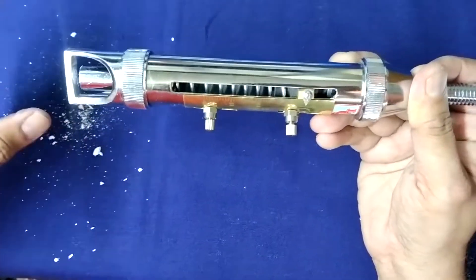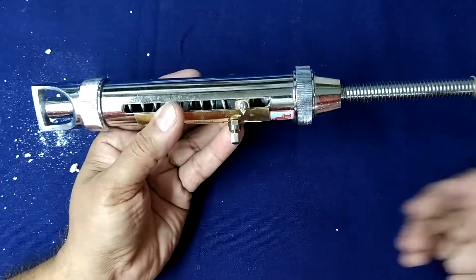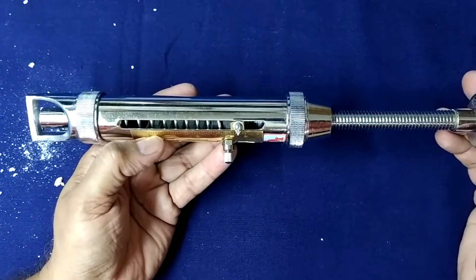Now take another tablet to find the hardness of a tablet with the help of the hardness tester.